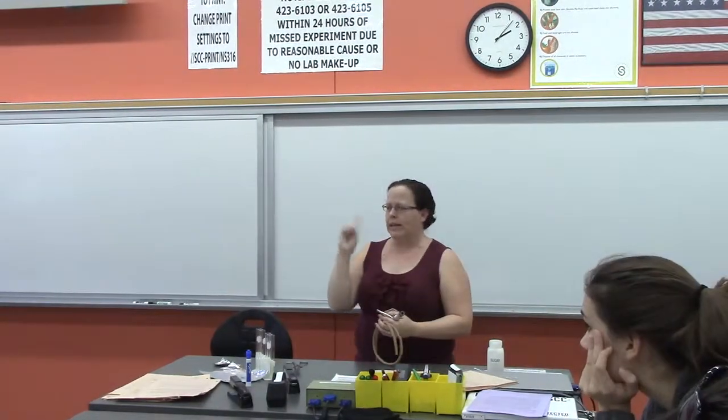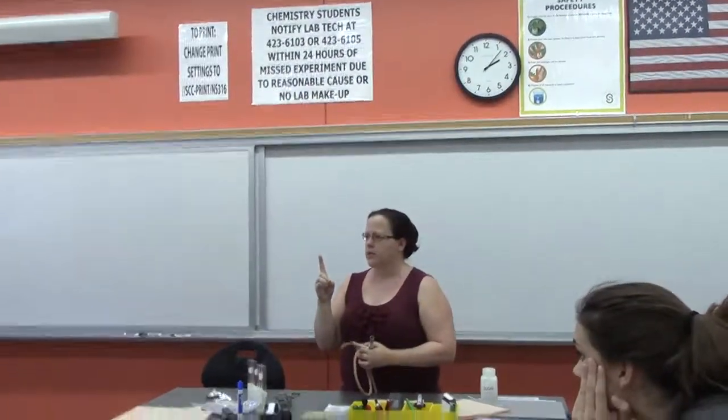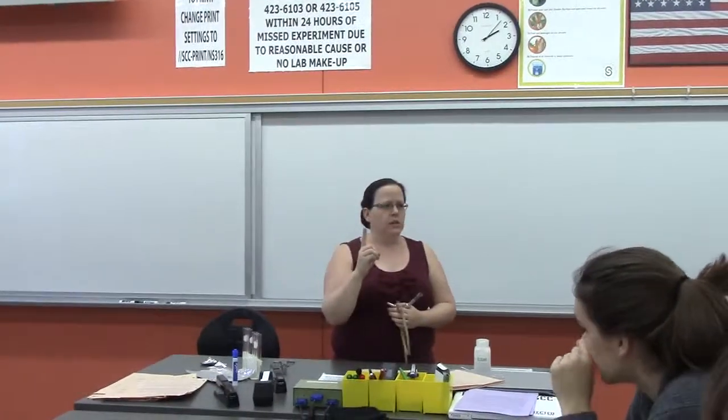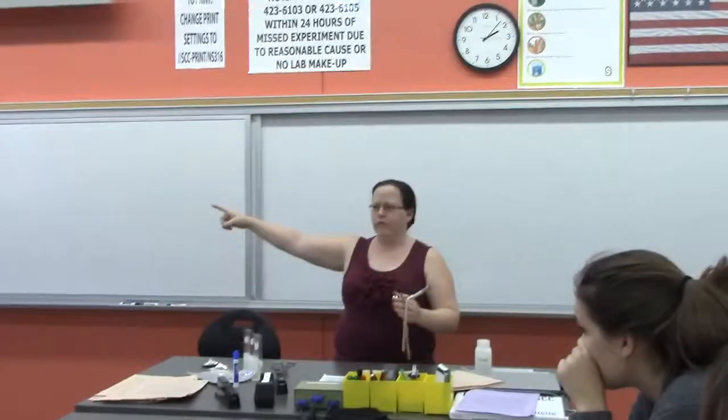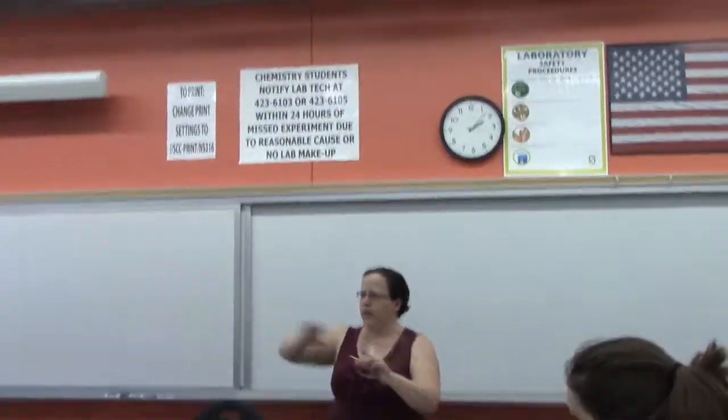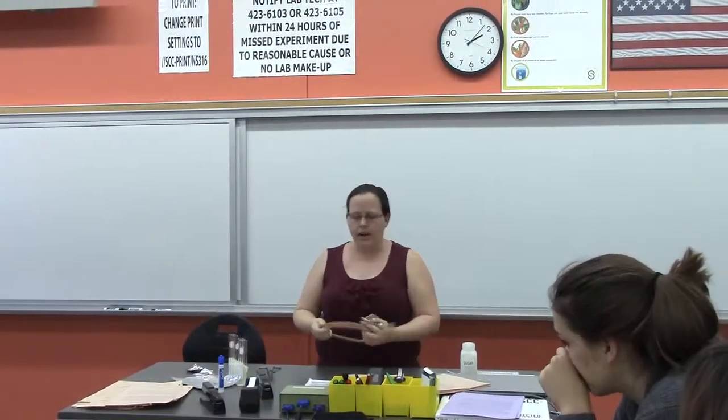What is the only thing you get to put in the trash? Burned matches. What is the only thing that should be going down our sinks? Water from washing your dishes. Okay, no chemicals ever go down the sink. Okay? All right, you guys are good to go.